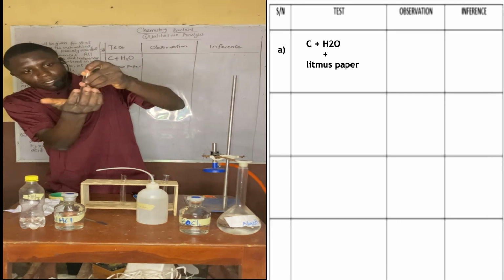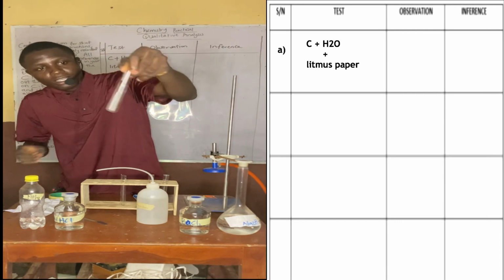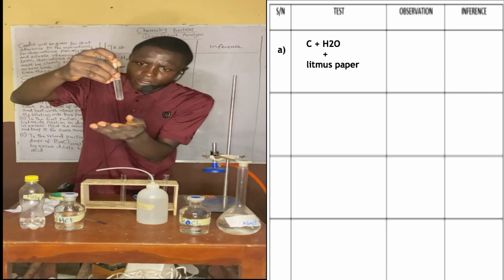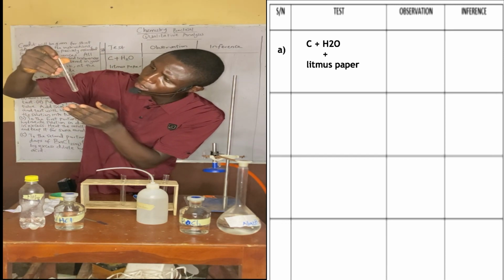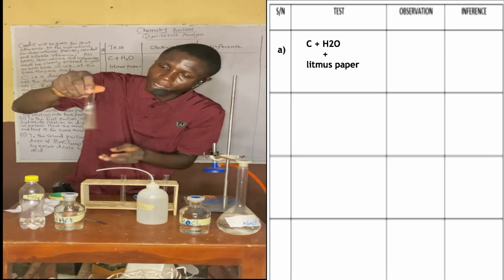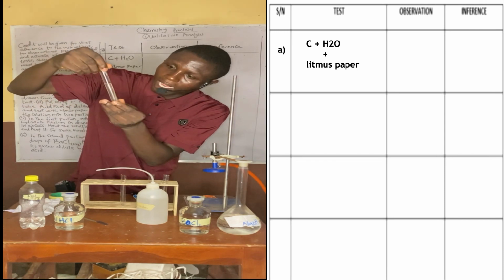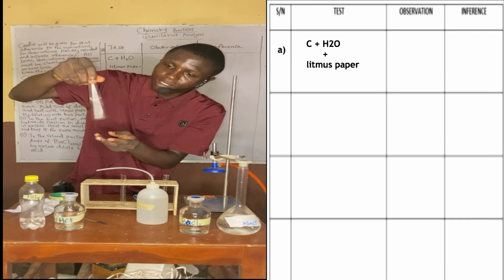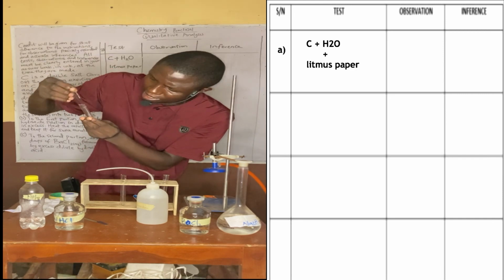You can see that the solute, which is the salt, is dissolving in the distilled water. Now you can see that it has become a light green solution.